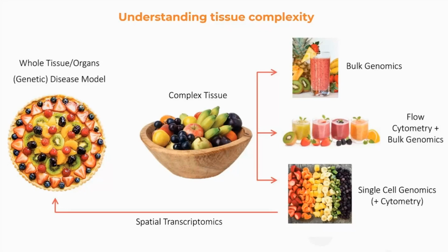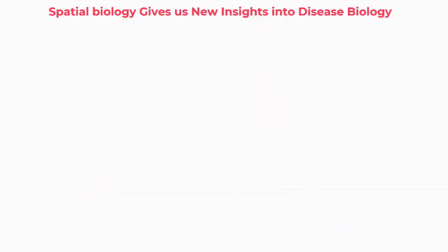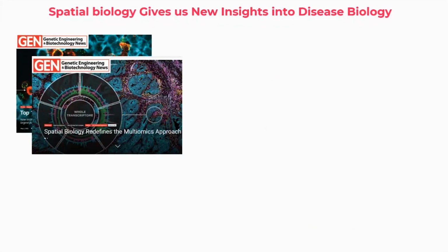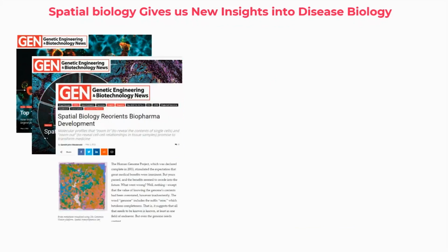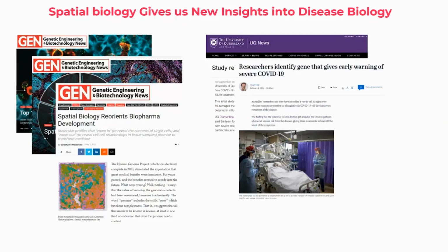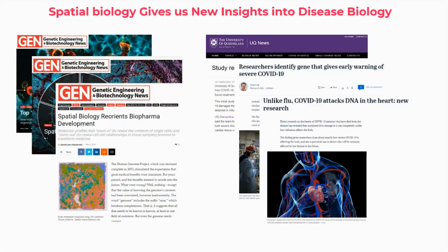My lab does almost exclusively spatial profiling, biology, transcriptomics, proteomics, and we're layering this omics stack, but very much focused on spatial. Spatial biology is giving us new insights into disease biology. We've written a couple of pieces for Gen-Eng Biotech on how spatial is reorienting biopharma development and how it's redefining the multi-omics approach. We've also had a couple of papers, which I'll talk to you about a bit later, on understanding viral localization in the lungs and in the heart, and the associated profiles we were able to look at in these studies.